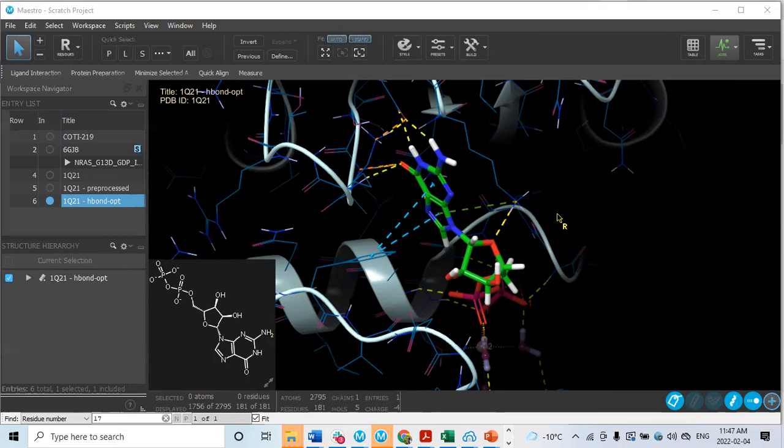The energy minimization that you mentioned, this is simply a geometry optimization, right? Yeah, exactly. It helps us to relax the structure and solve so many of the clashes that exist in the crystal structure, because in the crystal structure we actually need to pack the system. We have the crystal packing effect, which could affect the relation between the molecules.